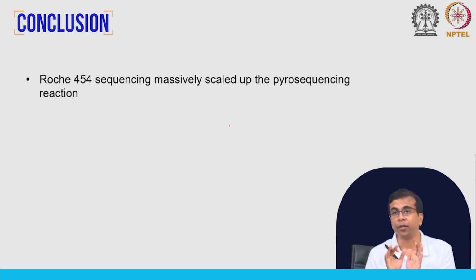It does not depend on the base itself; you end up with a light signal whichever the base is. This signal can be detected and indicates the addition of a base to the growing complementary strand, and this acts as the detection across these wells.